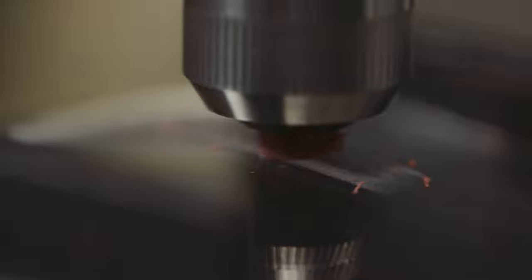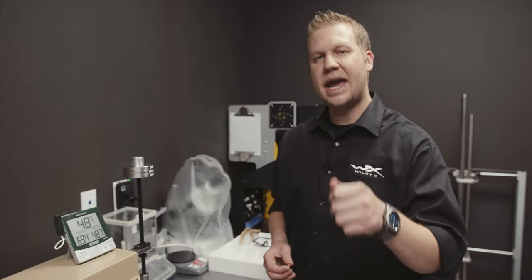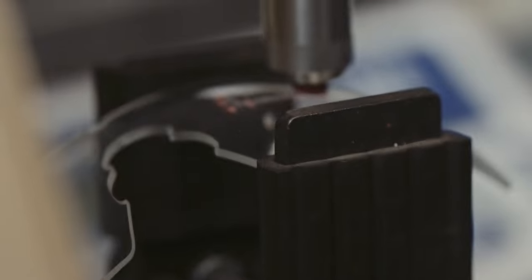What it's going to do is scratch the surface of your lens and the hard coat, and it's going to tell you how much haze you can gain on your lens before it fails.